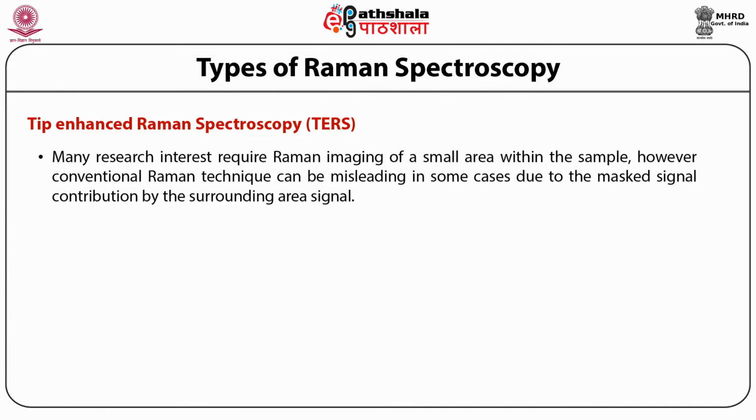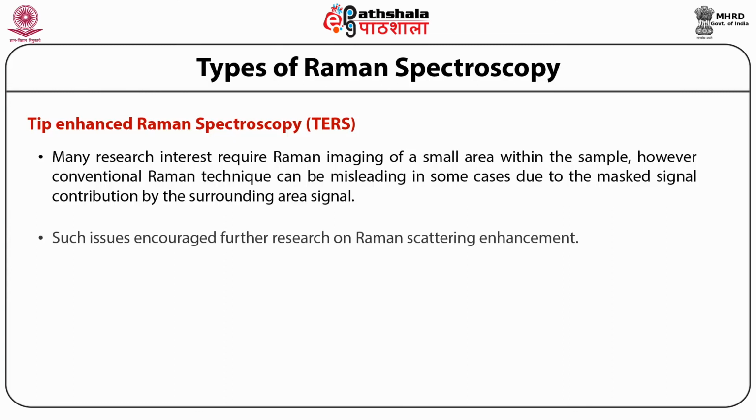Many research interests require Raman imaging of a small area within the sample. However, the conventional Raman technique can be misleading in some cases due to the masked signal contribution by the surrounding area signals. Such issues encouraged further research on Raman scattering enhancement.